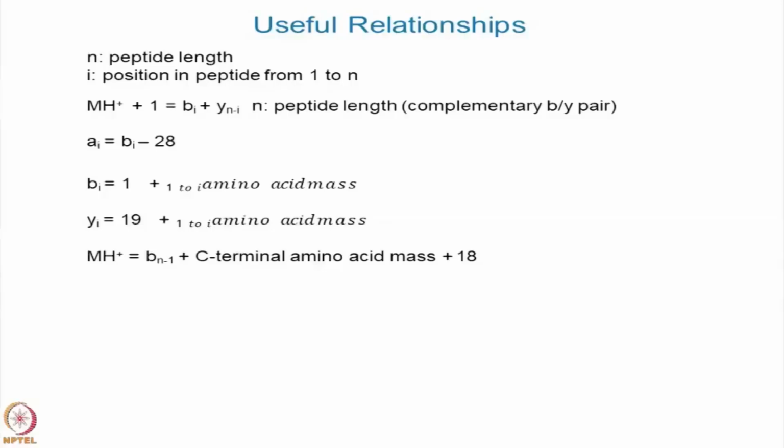Next. These are the amino acids. If you knew these by heart, it would be easier for you to look at the mass differences. If you had the opportunity to print them, that would be helpful. These are some things that are particularly helpful for you to know that we will make use of in interpreting the spectrum. An A ion is 28 Daltons less than a B ion, and if you can't decide whether an ion is an A or a B or a Y, and if it has something that's 28 Daltons less, then you can probably call it a B. That's why it's useful.